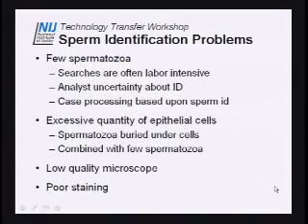And often, a lot of laboratories base their case processing upon sperm ID. There's a lot of laboratories that screen cases. They look at that slide, they don't see any spermatozoa, they're AP, PSA's negative, they go on. I'm sorry, they don't go on, they stop. That's the end of the processing of that case. But is that a true end, or is that a true process?